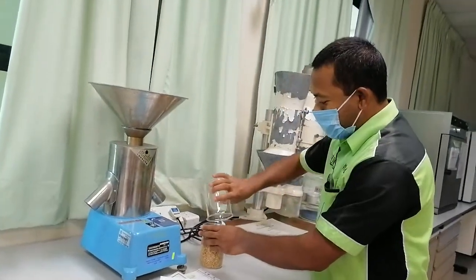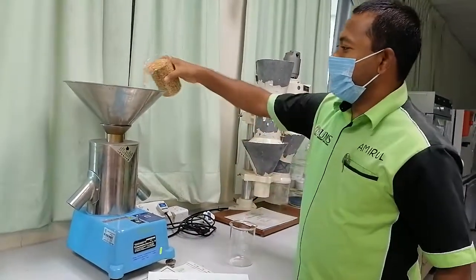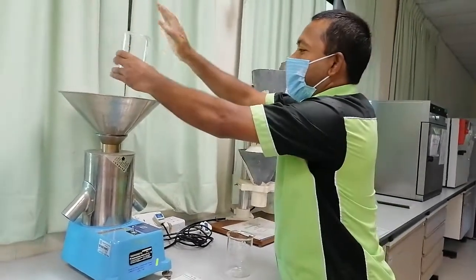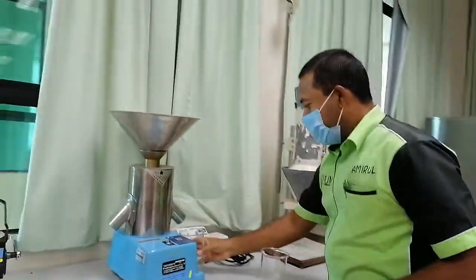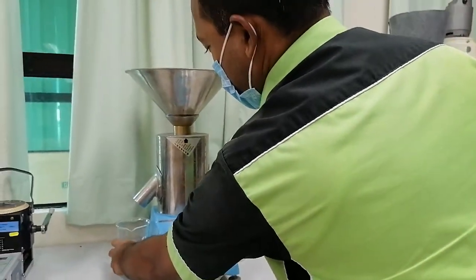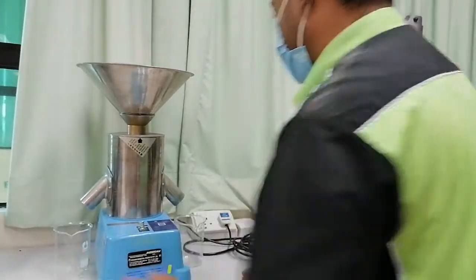Suppose, for example, I am giving — suppose this is one kilogram for example. Just put the seed inside. This is the inlet. This is outlet one. This is outlet two. You can see how they are dividing.